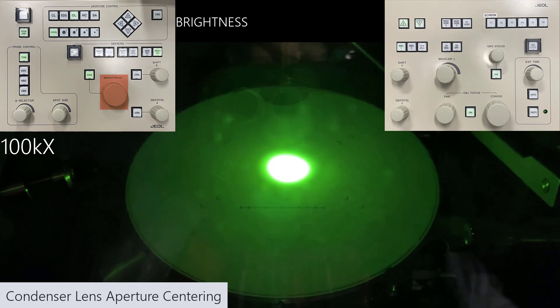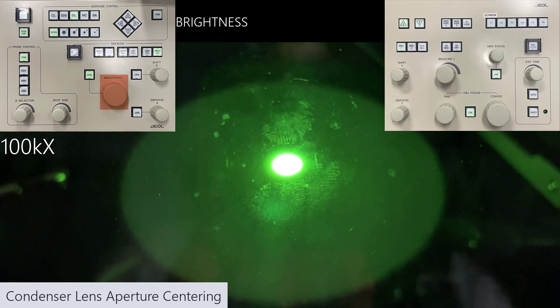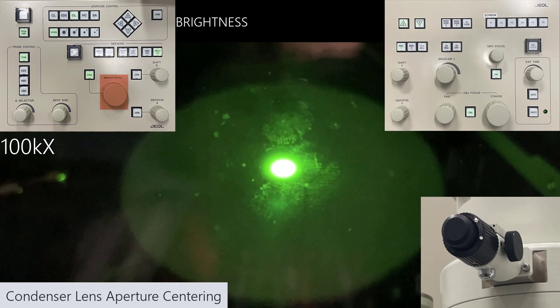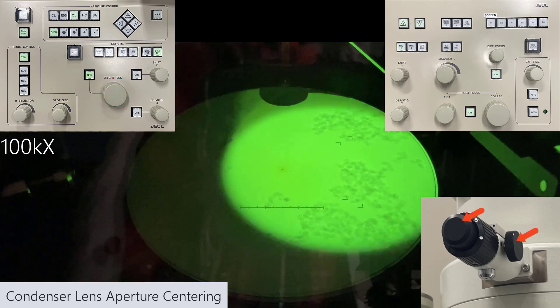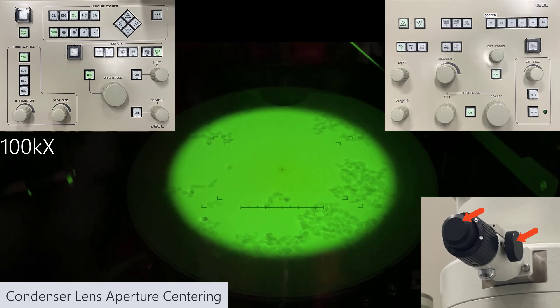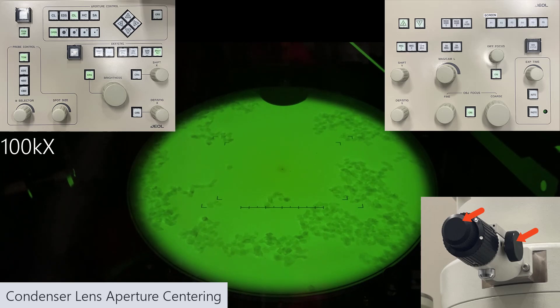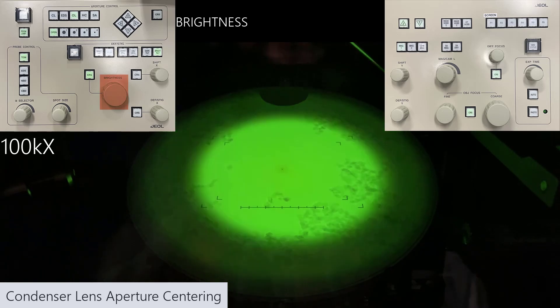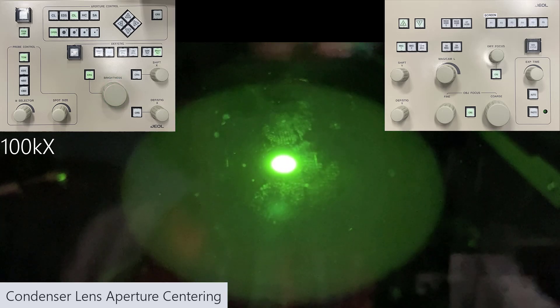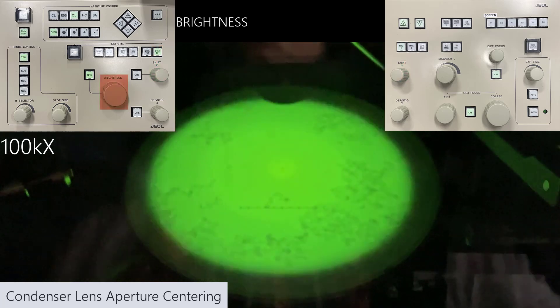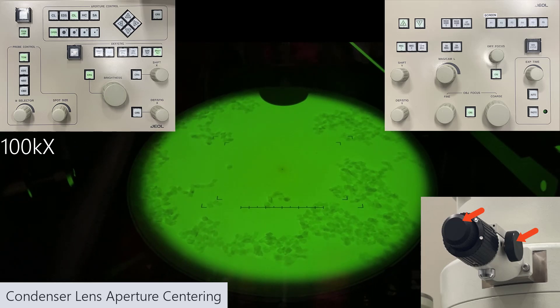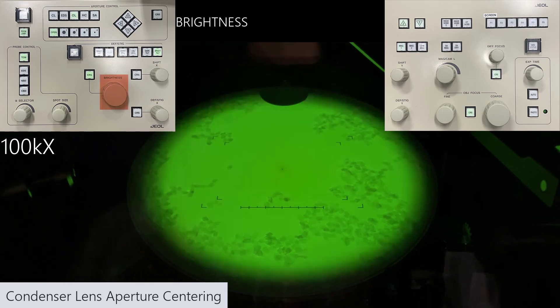Next is the condenser lens aperture centering. We're going to condense our beam to a spot and change to condenser lens aperture 2. I'm expanding the beam so that it covers the phosphor screen or just gets to the edge of it, and then I adjust the centering using the knobs on our aperture assembly, since we have a manual aperture. Then I condense the beam and make sure it's centered using the bright tilt button and the shift X and Y knobs. I iterate — expand the beam, center it with the aperture assembly knobs, condense it, confirm it's still centered.